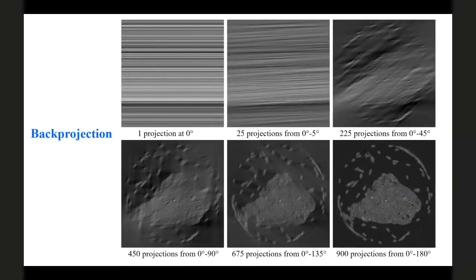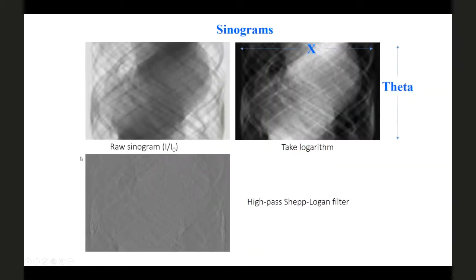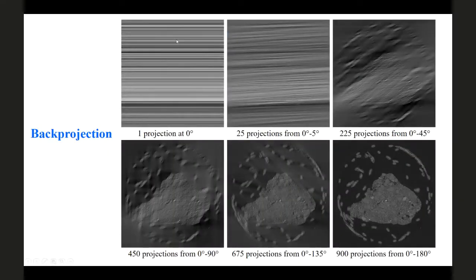So then the reconstruction, which is the sort of non-obvious step, conceptually it's easiest to think about back projection, although the technique that we're actually using is a little bit different. So imagine that you took the first row of this filtered sinogram and considered it to be a mask through which you are passing, let's say, visible light. So the dark areas are dark, and the light areas are where the ray passes through. So that would be the first projection. Now you go to the next angle and you project from that angle.